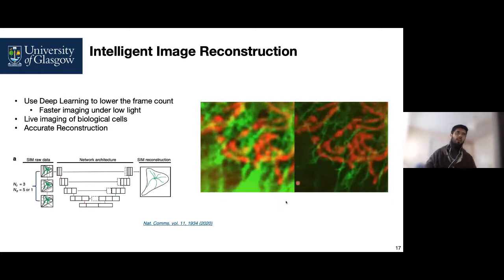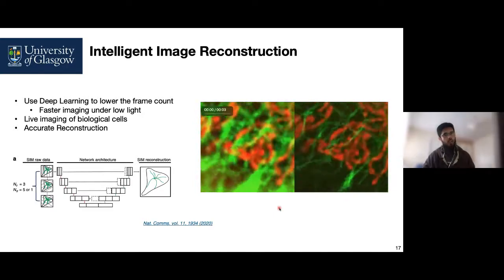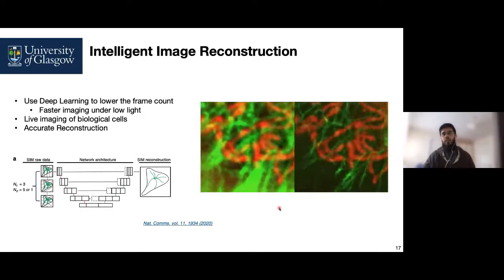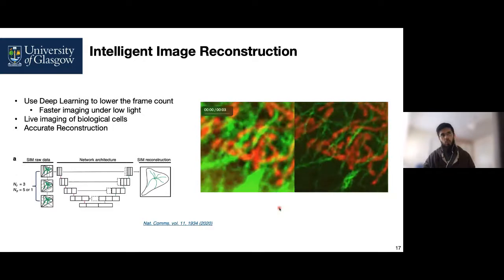So lately there has been a lot of research interest in utilizing deep learning and machine learning imaging enhancement techniques for much better resolution.